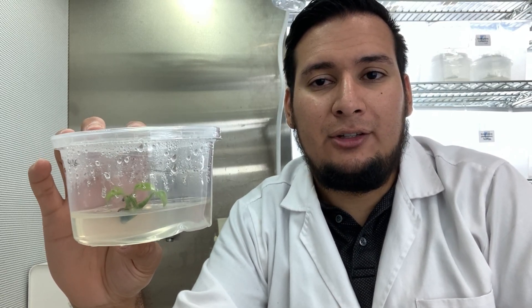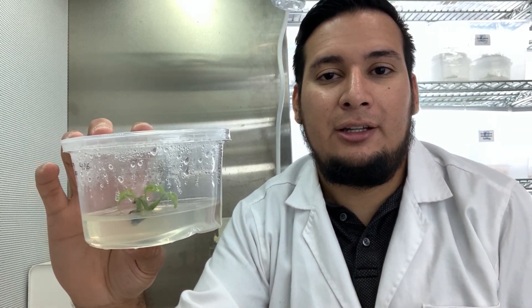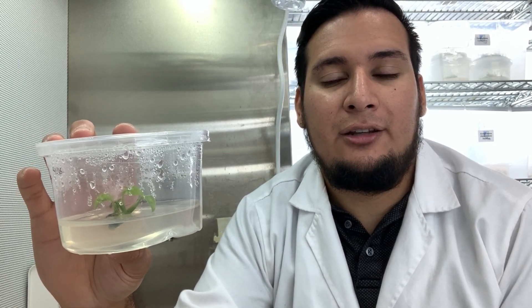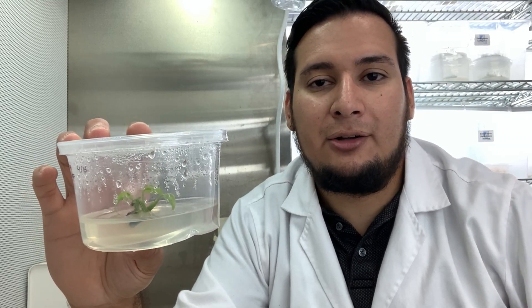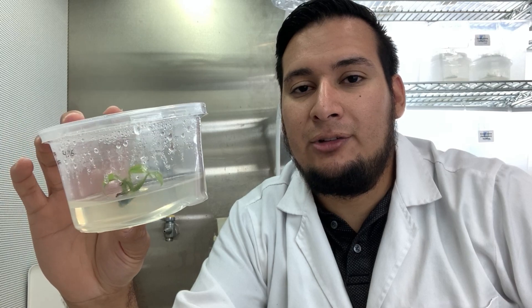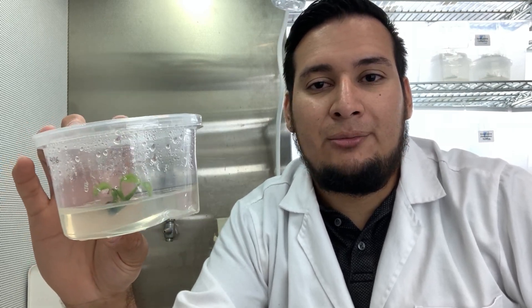The plant hasn't really grown at all, so I want to try something different. I want to place it in half MS media instead of full MS. This plant has always been in full MS and it's not doing well, so I want to reduce it to half MS and see if it does better. Some plants don't like full-strength MS media — carnivorous plants and aquatic plants, for example, don't do well on it or just die. It may be the case for the Monstera deliciosa.